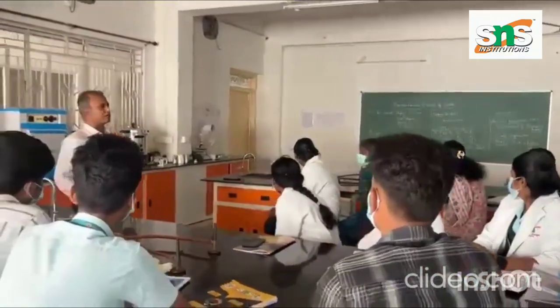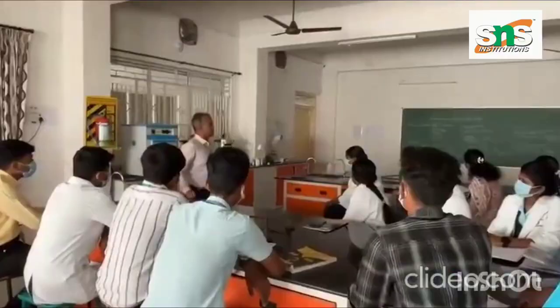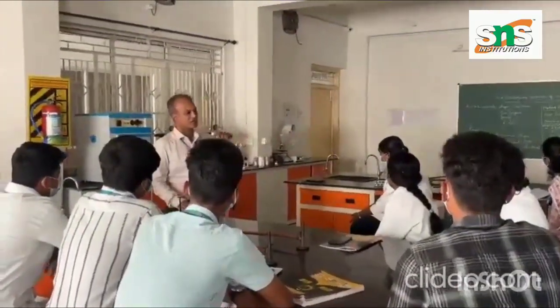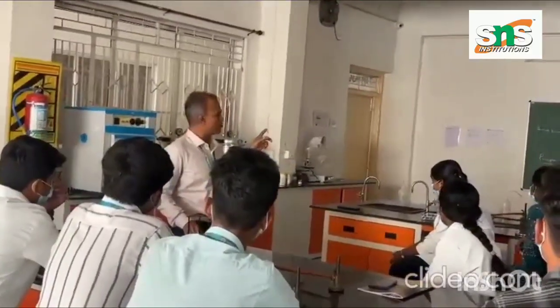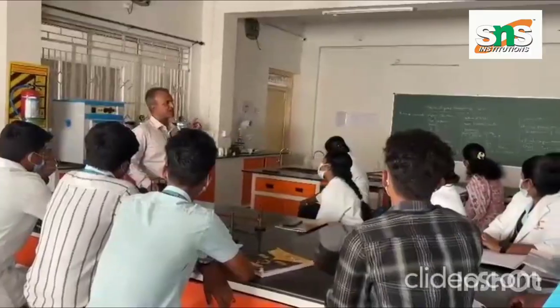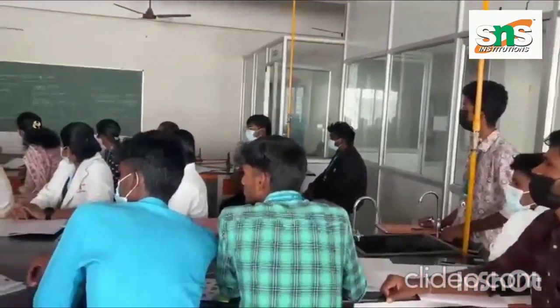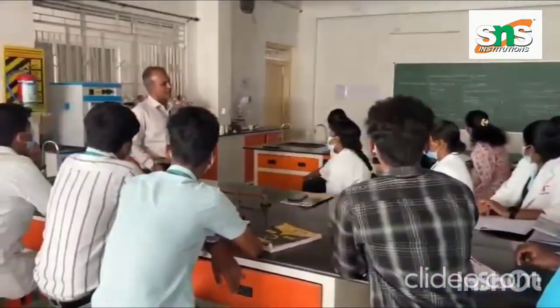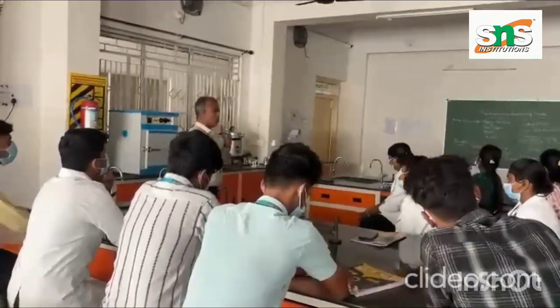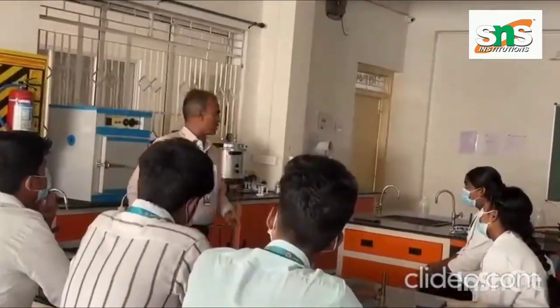This is the method we have to perform for the most probable number method. The broth is there, and inside we pour the water we are going to test. The first set of test tubes contains 50 ml of water with double strength broth, which is the nutrient medium for the bacteria. The second set of 5 test tubes contains 10 ml of water with single strength broth, and the third set contains 1 ml of water with single strength nutrient broth.